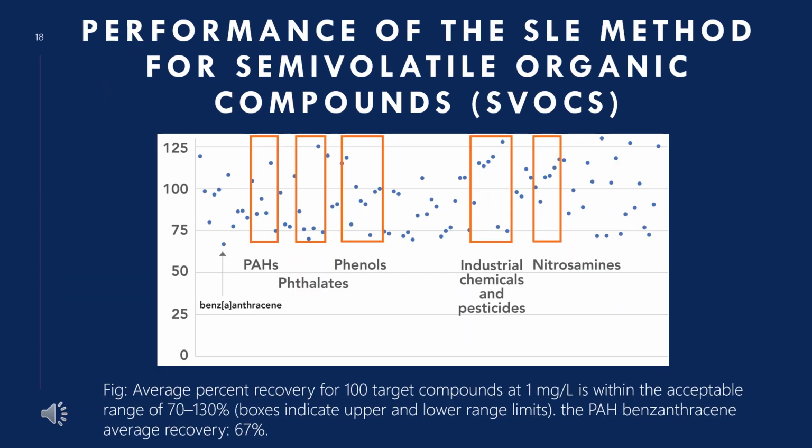Now my last slide is showing the performance of the supported liquid extraction method, from our selected paper. The first phase of the work focused on the EPA method 625.1, where the semi-volatile organic compounds, the classes of nitrosamines, pesticides, phenols, PAHs, and PCBs in industrial discharges are analyzed. These fall into 2 categories of the BNA compounds, where BNA means base, neutral, and acidic compounds.